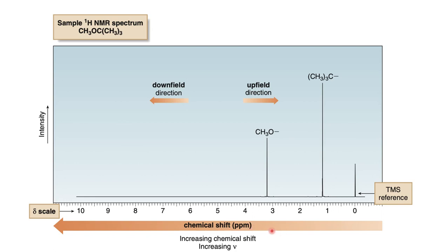The chemical shift on the x-axis gives the position of the NMR signals of various protons in a sample. The structure of tertiary butyl methyl ether contains three methyl groups attached on the carbon, and one methyl group attached with the oxygen.